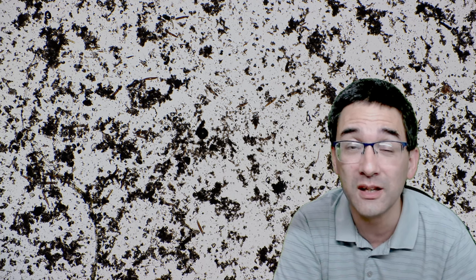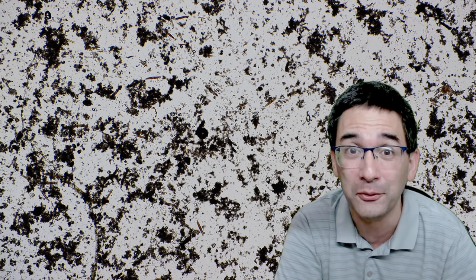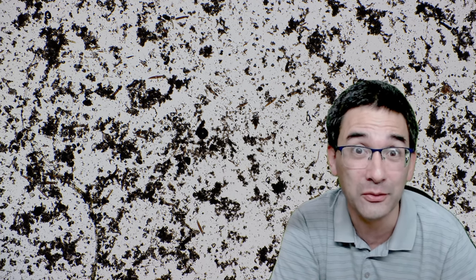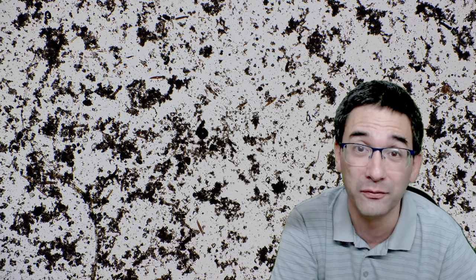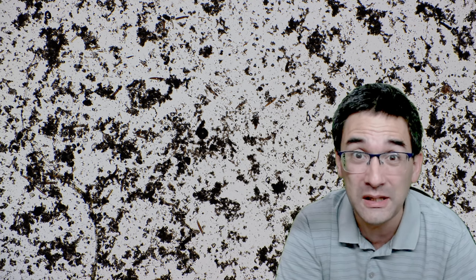I mean you think that there is really nothing interesting in the specimen. I just want to show you a very typical video here. Look at this. This is something that I just recently found and very disappointing really. There are lots of debris and not so much movement going on.